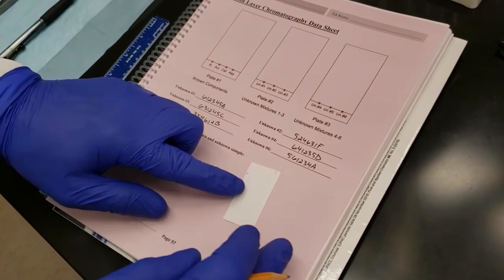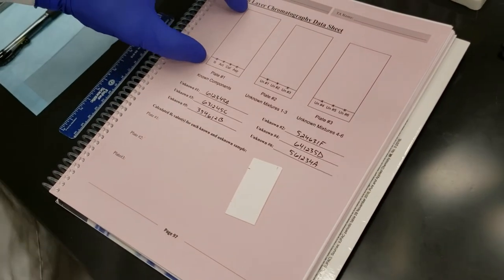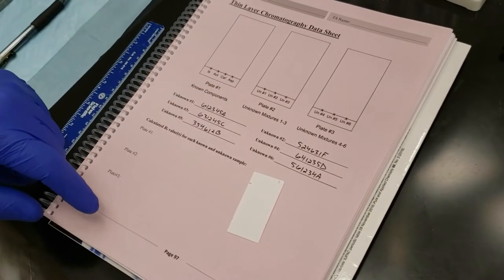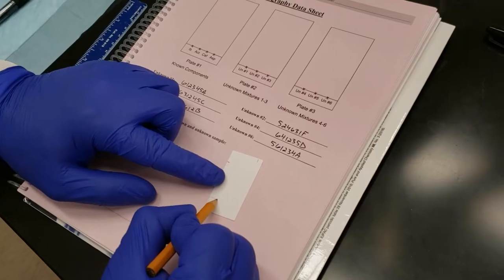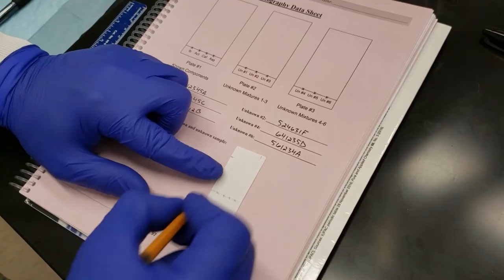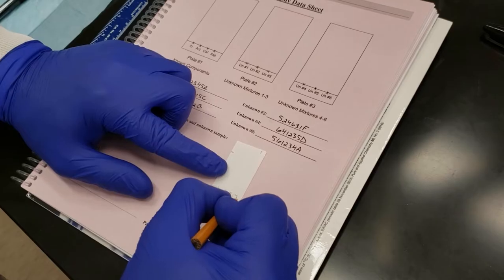But we have to figure out exactly where we need to do our spotting. So we measure up about 1 centimeter from the bottom of the plate. This will be the bottom of our plate. I've indicated plate number one, and I'm constructing it to match what we see on our data sheet. So this is our first plate that has ibuprofen, acetaminophen, caffeine, and aspirin. So we're going to have four lanes. We draw our origin line with a dull pencil right at 1 centimeter. And then we're going to put four lanes, just with small X's, across that origin line. First one being ibuprofen, then acetaminophen, caffeine, and aspirin.